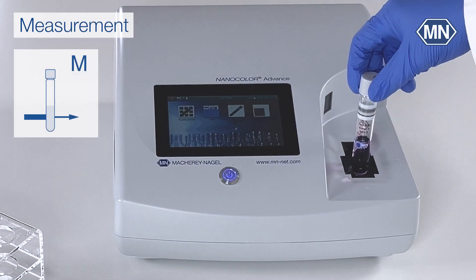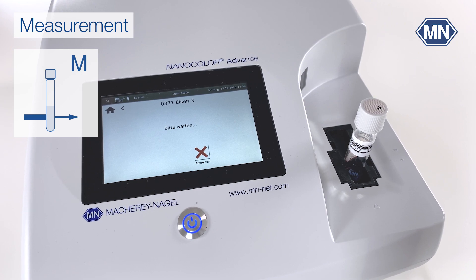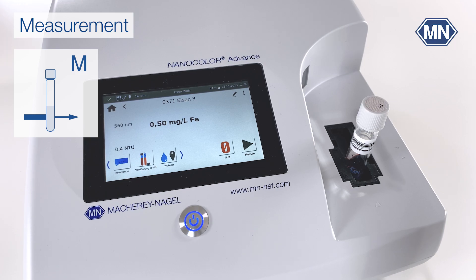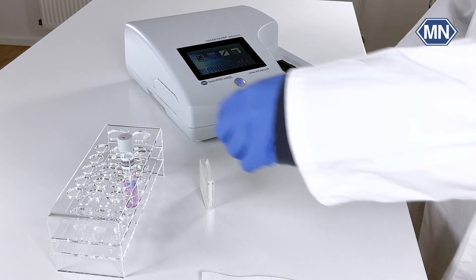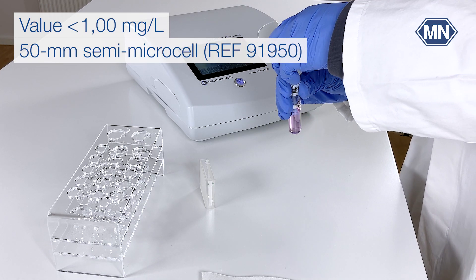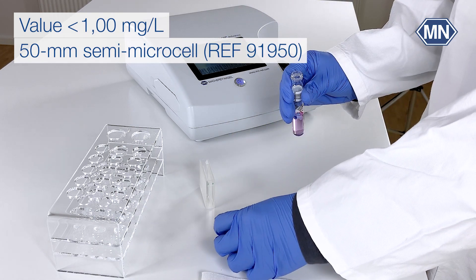Place the test tube in the cuvette slot. The photometer automatically detects the correct method and starts the measurement. For values below 1 mg per liter, a measurement in the 50 mm semi-microcell is recommended.